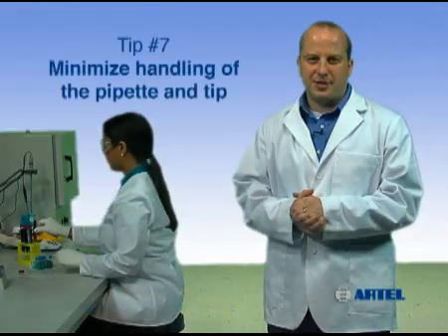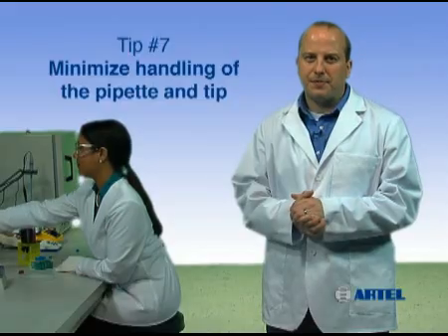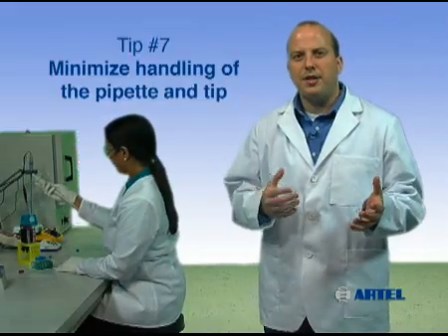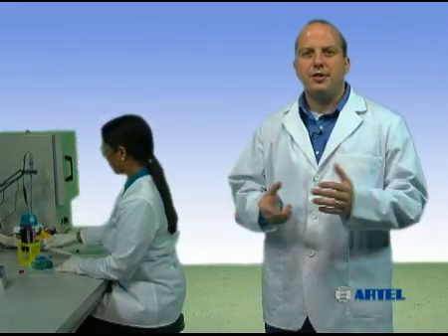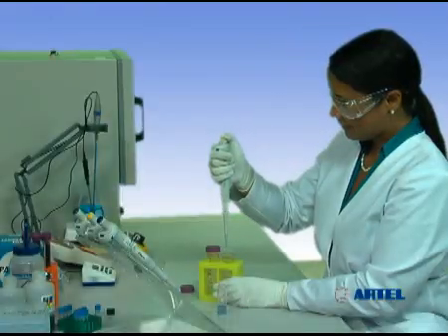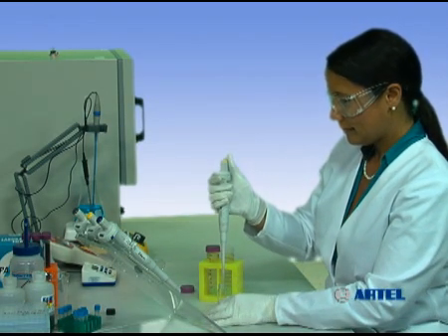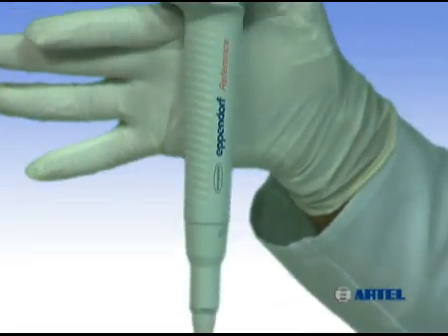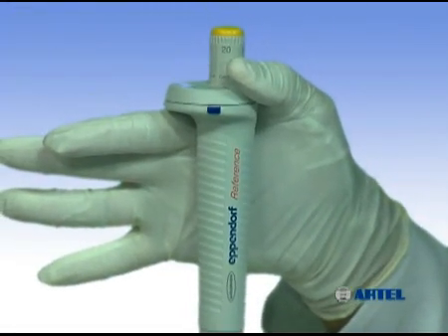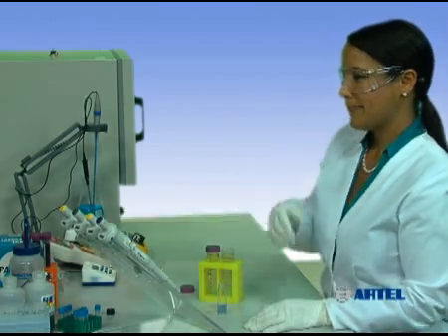Pipetting tip number seven: minimize handling of the pipet and the tip. Avoid overhandling the pipet and tips. Body heat transferred to the pipet during handling disrupts temperature equilibrium. As the pipet heats up, the air space inside the tip expands and pushes the liquid out of the tip, causing less sample to be delivered. Avoid this type of error by holding the pipet loosely between each transfer, or return the pipet to the stand or set it down between sample deliveries.